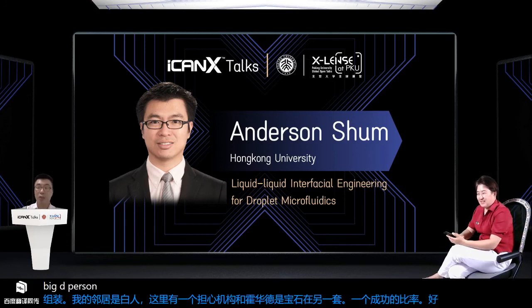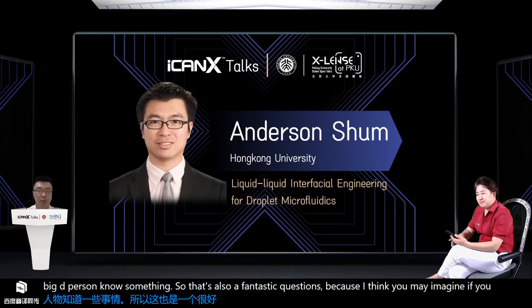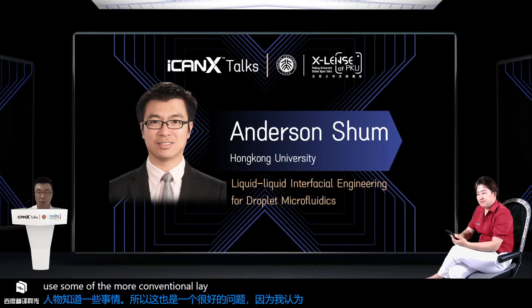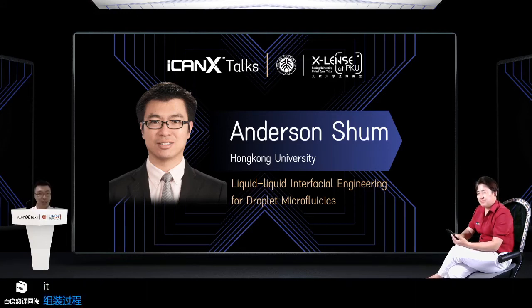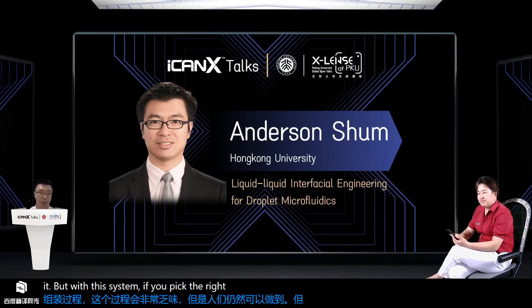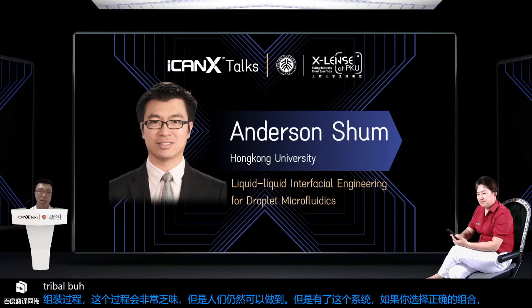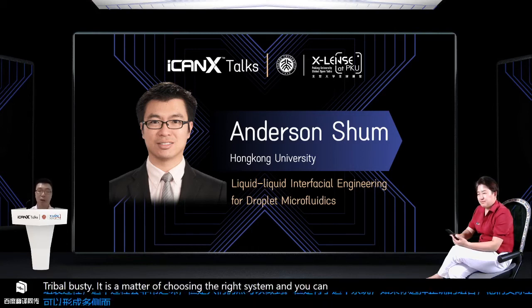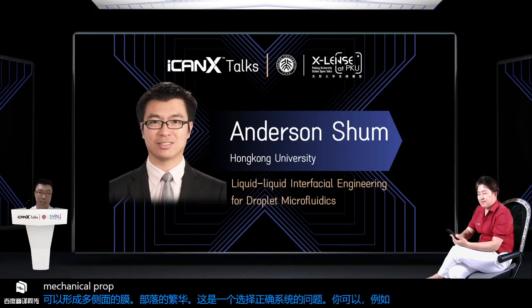I see. That's also a fantastic question. If you use the more conventional layer-by-layer process, it can be very tedious, but people can still do it. With this system, if you pick the right polyelectrolyte combinations, they can form the polyelectrolyte membrane quite robustly. So it's a matter of choosing the right system, and you can investigate that by studying the mechanical properties and the assembly steps.